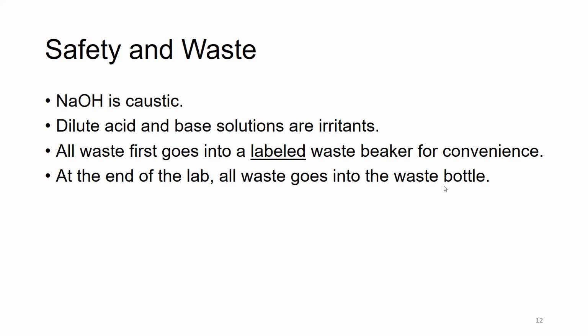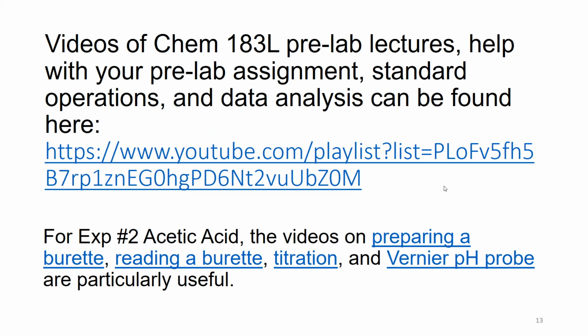Some of the videos I'd like you to watch. Again, over here, this is a playlist that includes a lot of videos for Chemistry 183 lab this quarter. But particularly for experiment number 2, acetic acid, I'd like you to watch a video on preparing a burette, reading a burette, the titration skills, and a video on pH probe.